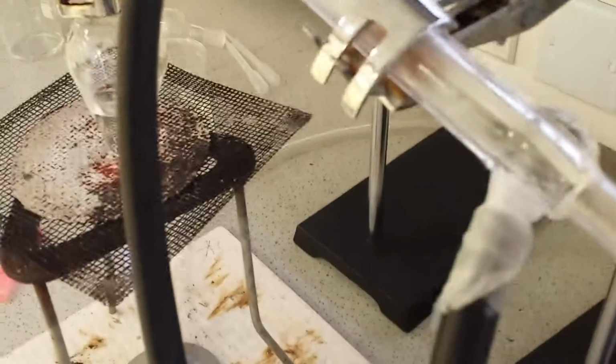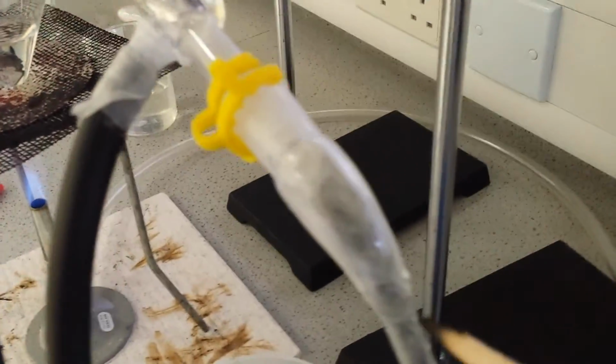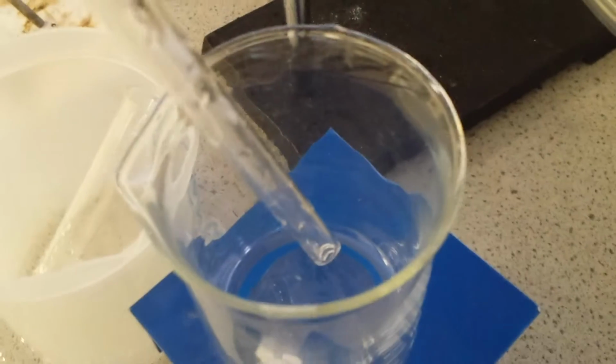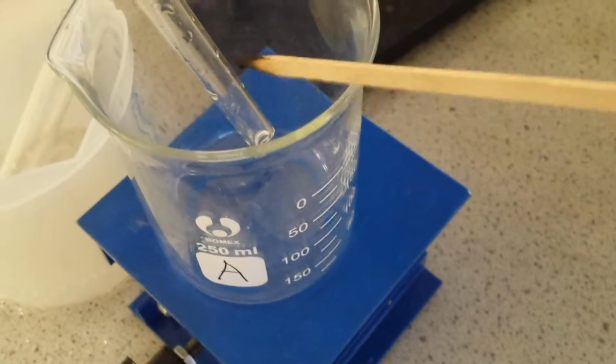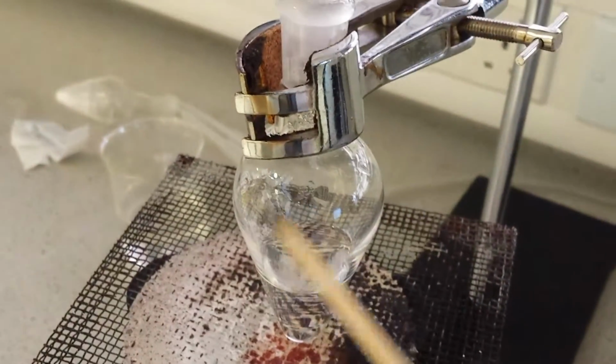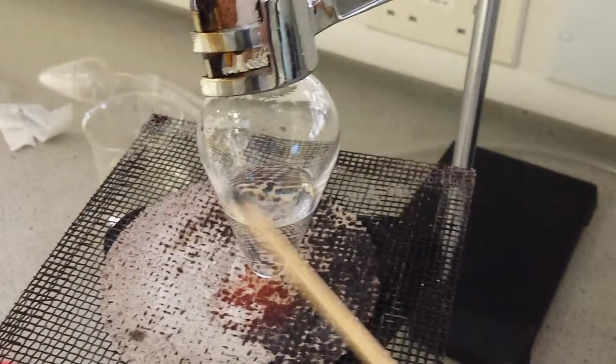Now once the steam cools down, it's going to exit this tube over here into this beaker. And what do you think is going to happen? What kind of water are we going to get in this tube later on? Think about that. Now, once all the water has been evaporated from this flask, what do you think will be left behind here?